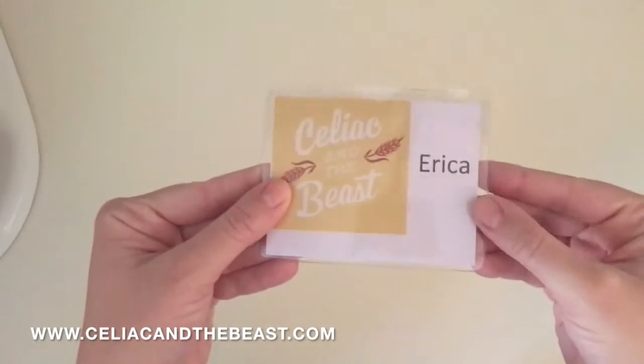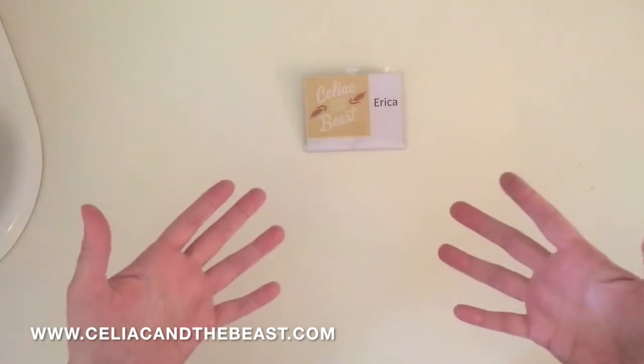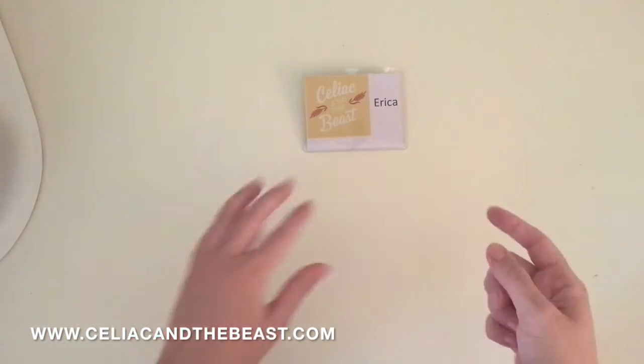Hey guys, this is Erica with Celiac and the Beast, and I'm here in my kitchen doing an unboxing video for NEMA sensors. Hang on and we'll show you exactly what you're going to get when you receive your NEMA sensor.